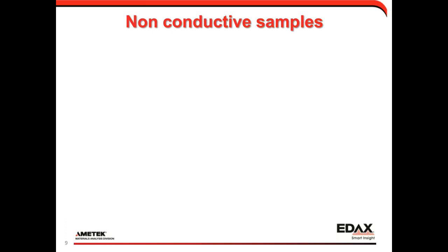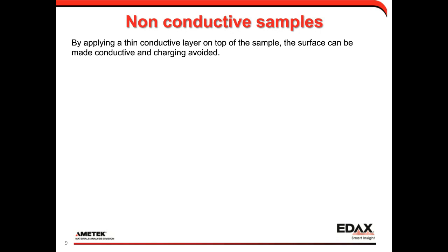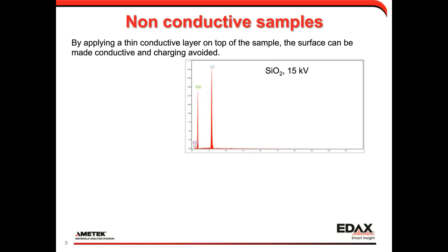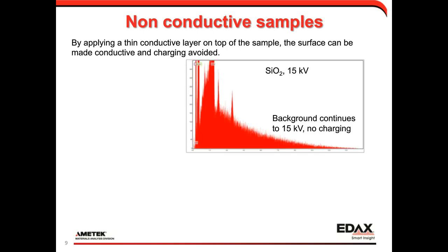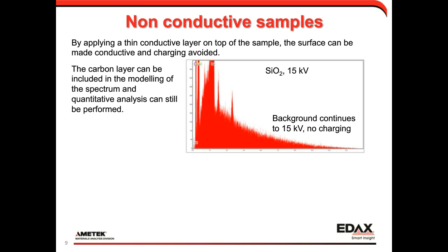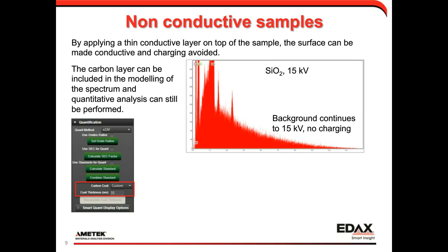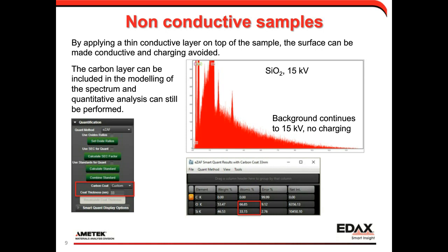To eliminate charging, we can apply a coating. For EDS analysis, carbon coating is standard. On a carbon-coated SiO₂ glass sample at 15 kV, we see the background continues all the way out to 15 kV — no charge buildup. The added carbon layer can be corrected for in most EDS software. In TEAM software there's a carbon coat correction where you enter the coating thickness, and quantification still comes out accurate — in this SiO₂ example, the atomic ratio is spot on.